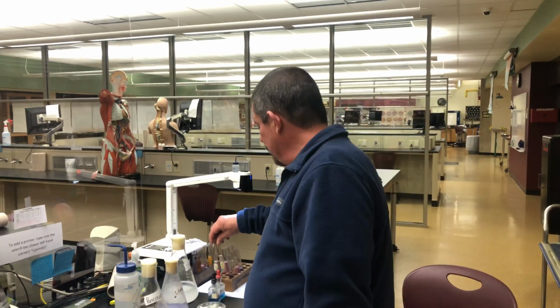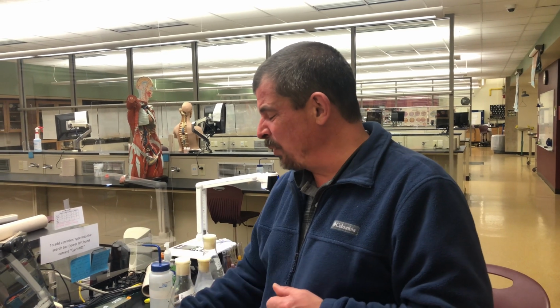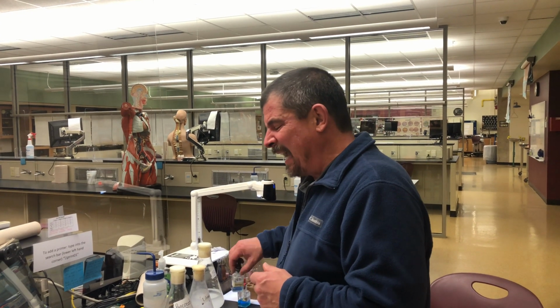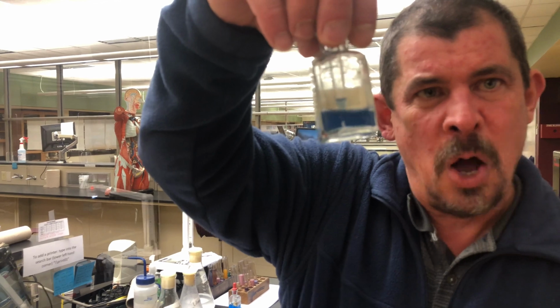So we let that go for an hour and a half, and then we pull the test tubes out. Now looking at letter B in your checklist, we're just going to read along here. After incubating, add enough Biuret's reagent, Biuret solution, and here's the Biuret solution, this bluish compound.